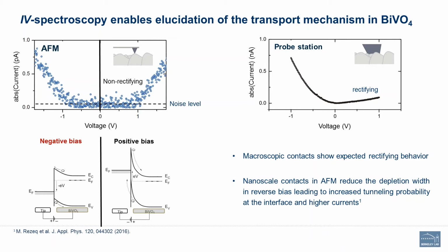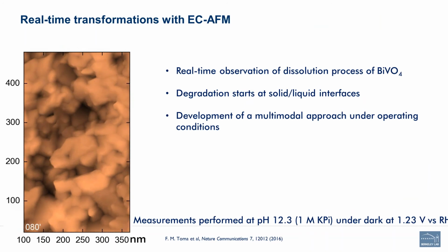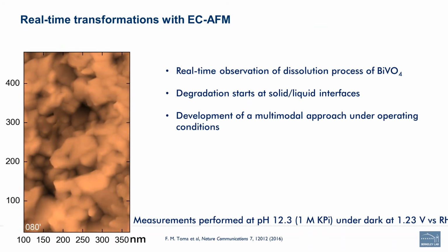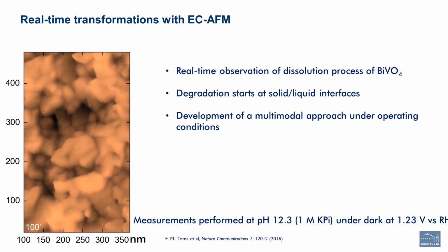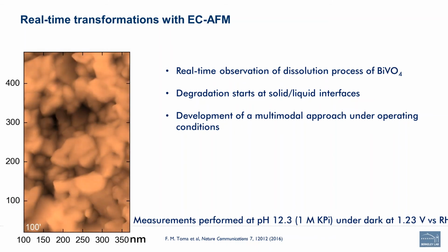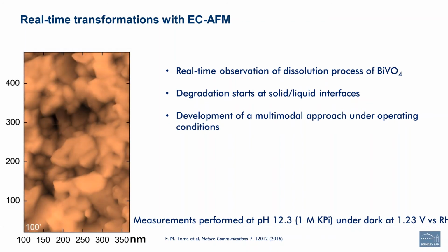With BiVO4, we are facing the challenge that it is not stable under operation conditions. And what Francesca observed in her measurements is that the grains shrink and the material gets dissolved in the electrolyte. So this fact makes it really challenging to perform measurements on BiVO4 under operation conditions.